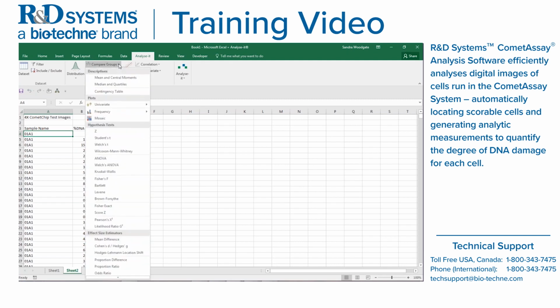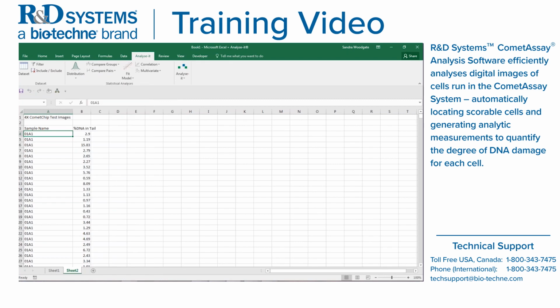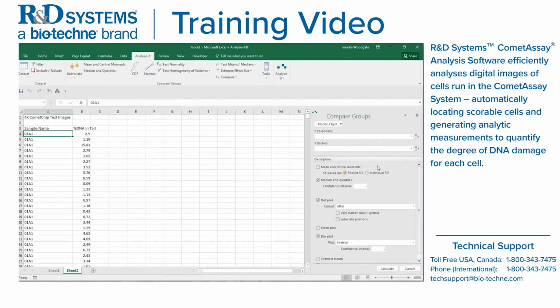Then we're going to compare groups. Let's select median and quartiles. All right, then we have to start filling in information in order to make the box plot. So the Y response is going to be percent DNA in the tail. The X factor, that's your sample name. So we're going to click on mean, so we get the central moments based on pooled standard deviation. We want median and quartiles. We're going to do a confidence interval of 80. We're not going to do a dot plot. We're only going to do a box plot, and we are going to select skeletal with a confidence interval of 80, and then just select calculate.